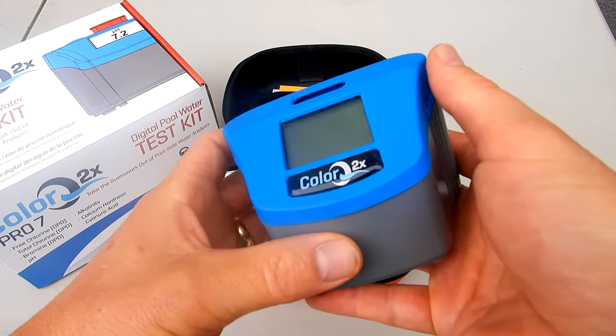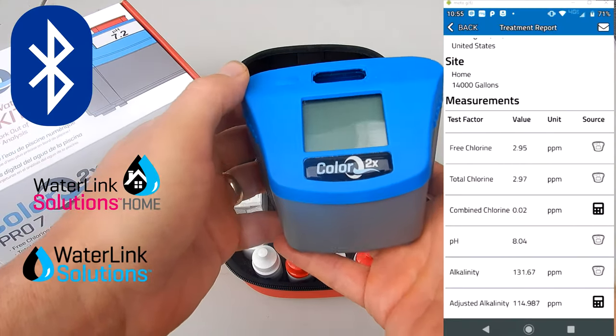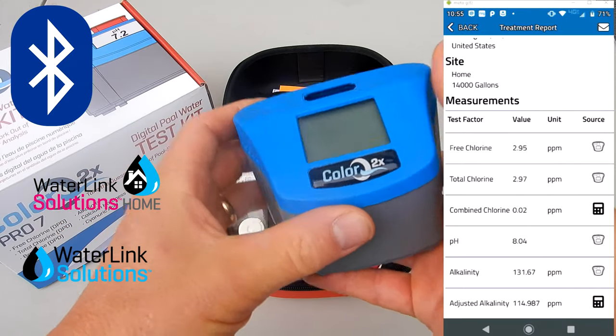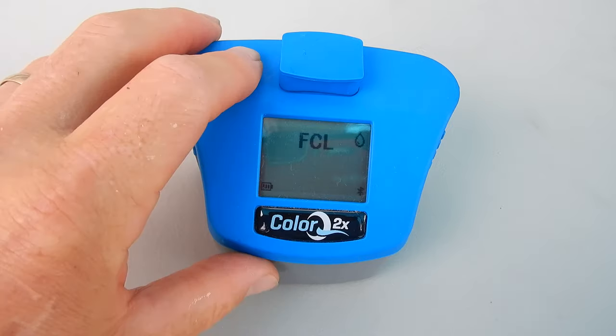One of the nice upgrades is that the ColorQ 2X is completely waterproof and it's also Bluetooth enabled. If you're using the WaterLink Solutions Home or WaterLink Solutions app, you can send your test results directly to your phone or device, and then you can email them to yourself or to a client.